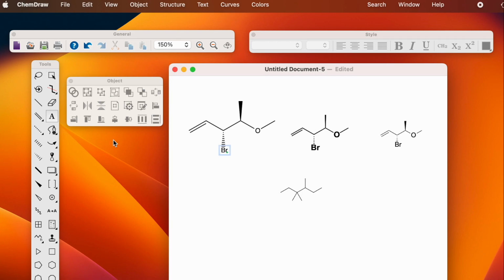Then the way to add atoms is to click on text and then to try to get an atom to be selected, and then click on it, and then you can put either one atom or a group of atoms. You can click text anywhere on the page to put captions or names or any other word you want to put there. Let's say we wanted to have that.